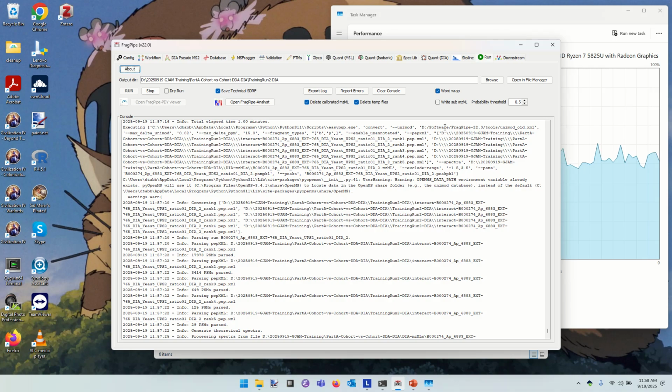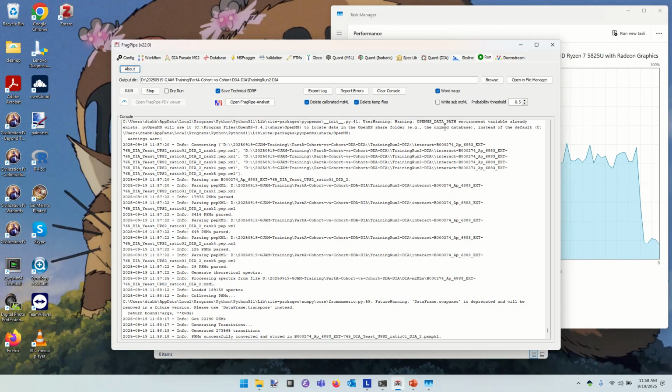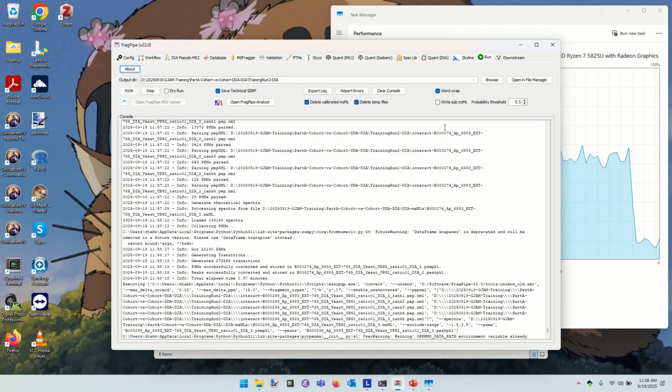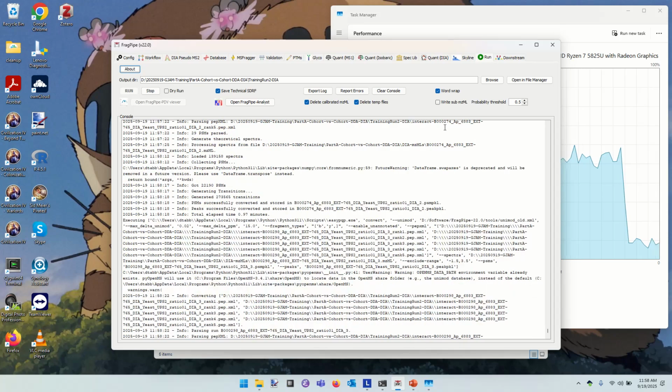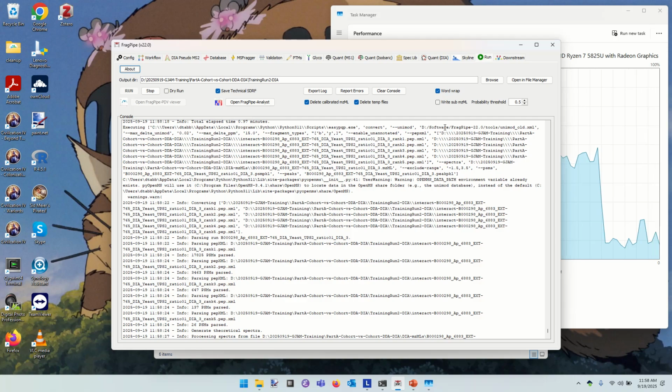Oh yeah, no, but like for an individual run at time whatever seconds, there's one MSMS scan in this particular window, and you can only find 5 precursors. Yes. For a peptide to be detected, it must be in the top 5 for at least one MSMS. Okay, but they are recorded still in the entire period. They're just not necessarily in the top, but you could still use the other measurements for quantification.